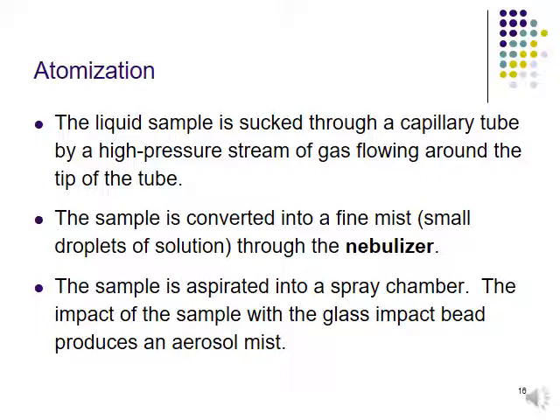Next, the sample is converted into a fine mist. Just like what I mentioned just now, the fine mist here refers to the small droplets of solution. At this stage, it must pass through the nebulizer, and the sample is aspirated into the spray chamber. The impact of the sample with the glass impact bead produces aerosol mist. This is the part I mentioned just now, that it will become a fine mist.